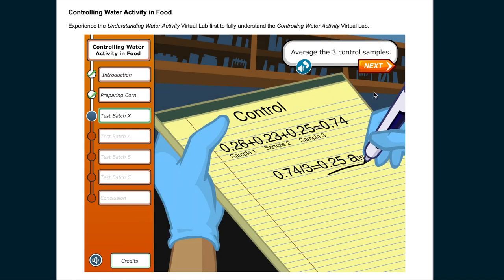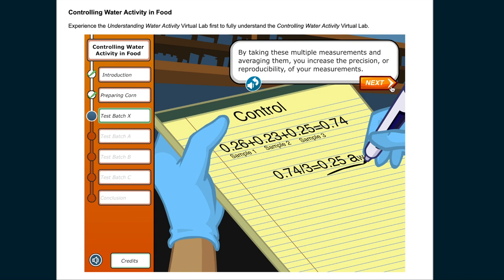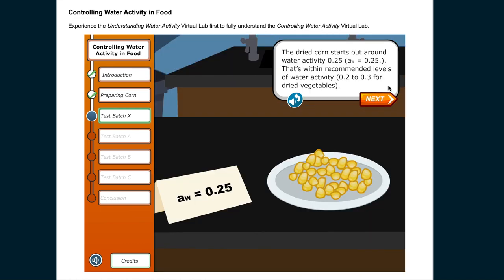Average the three control samples. By taking these multiple measurements and averaging them, you increase the precision or reproducibility of your measurements. The dried corn starts out around water activity 0.25. That's within recommended levels of water activity, 0.2 to 0.3 for dried vegetables.